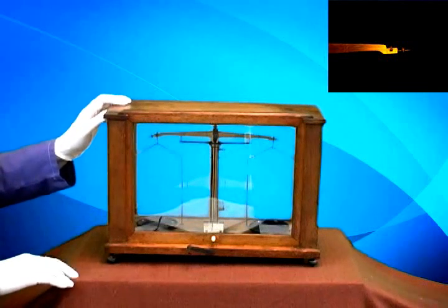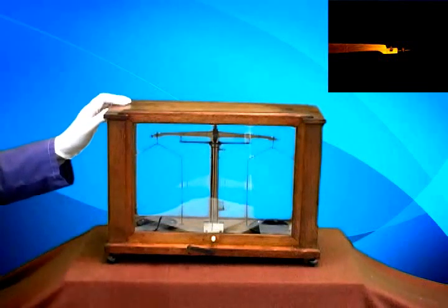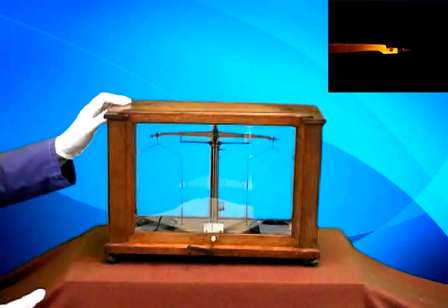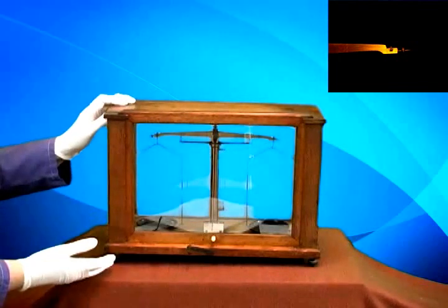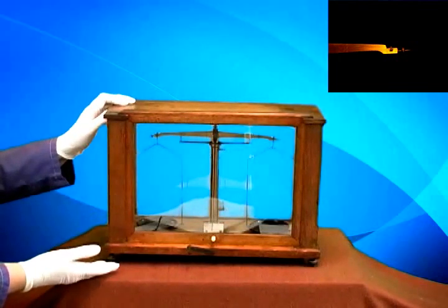Do you wonder how John Dalton was able to make accurate measurements of mass in his experiments? Well, he probably had a balance of this type.